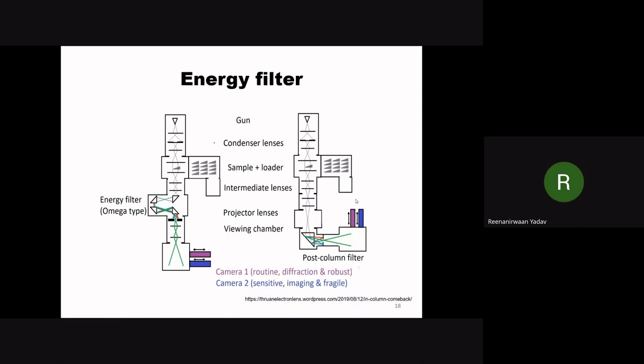They are nothing but electromagnetic lenses or prisms, which are used to allow only the electrons which are scattered elastically. Those which lose energy either get absorbed by the dispersion caused by these lenses in the wall of the microscope or are limited by a slit. Next.